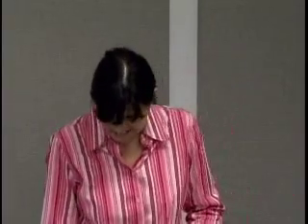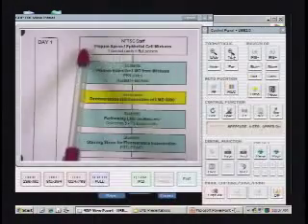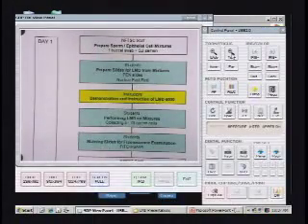So you see, there's a lot of behind-the-scenes work going on, and Carrie isn't here, but Carrie has been working in that lab, late at night, too. Before you got here, she was preparing these mixtures for the laboratory, so you know what kind of mixtures you are dealing with. Kind of made them a little easy for you guys. We were mixing one buccal swab with about 5 microliters of neat semen. And she was eluting the cells off of those and preparing the cell pellets.